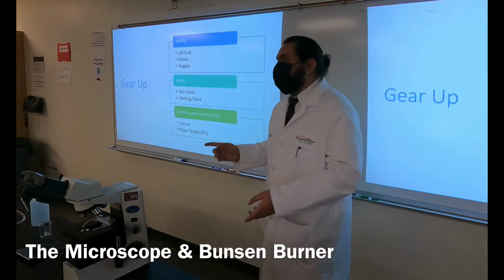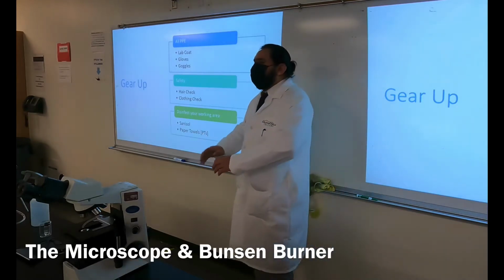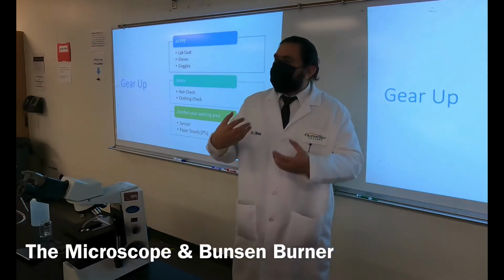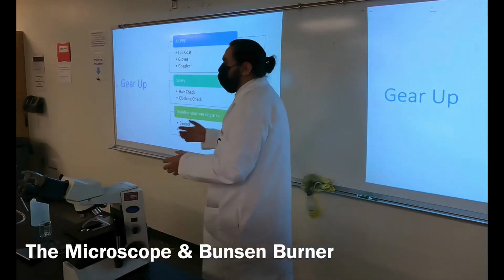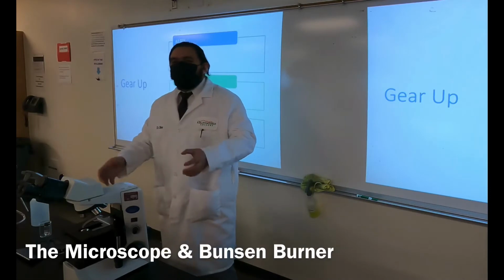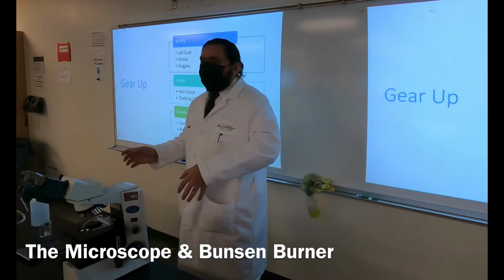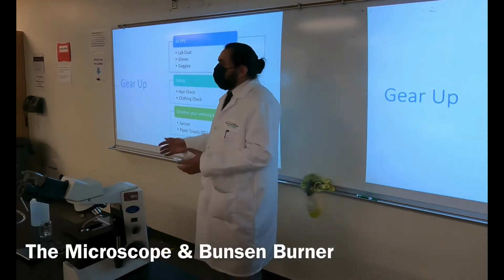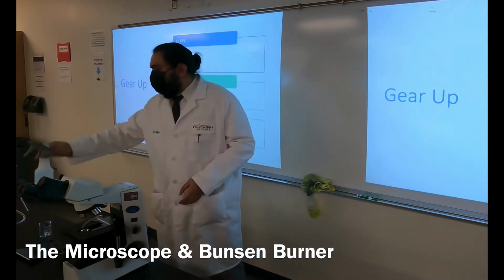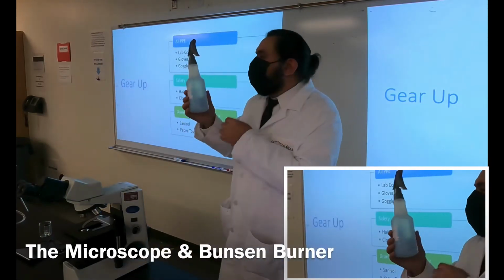We're going to have some fun demos on that. And then the next thing you want to do, just to get yourself in the habit, is trust no one. This is one of those infamous statements that I make all the time. You don't know who was here before you, so you don't know what they did. You don't know if they licked the bench or something like that and put Ebola on it. So get yourself used to finding your little bottle of Sanisol. It's this off-blue kind of solution.